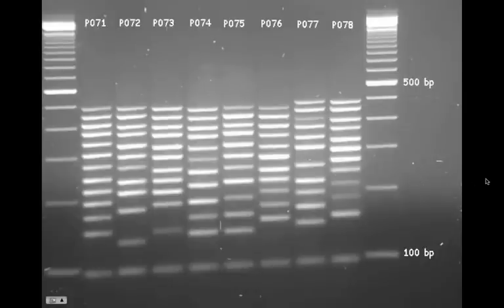Now, look at this diagram. This is an x-ray film taken of a gel. Obviously, these little DNA fragments had radioactive probes associated with them and the radioactivity was exposing the x-ray film. And so wherever the fragments are in the gel, you get this white line in your x-ray film. Where do you think the wells were in this gel? Were they at the top or were they at the bottom? Pause the video and think about it. Okay, now that you're back, this top side is probably where the wells were. And the reason you can tell that is because we have this marker lane over here. And if you look at it, this indicates 500 base pairs, 500 BP, and this is 100 base pairs. And the thing that you need to remember is that the smaller fragments travel further on the gel. And so what a gel electrophoresis does is it arrays DNA fragments according to size. The smallest ones are farthest from the well and the largest fragments are closest to the wells where the DNA was originally loaded.